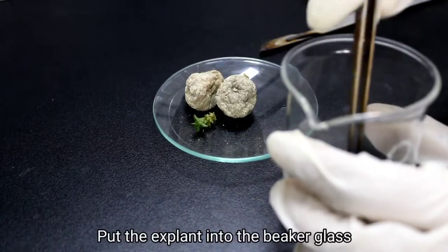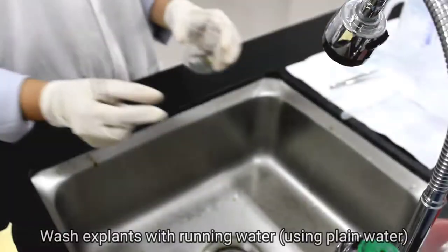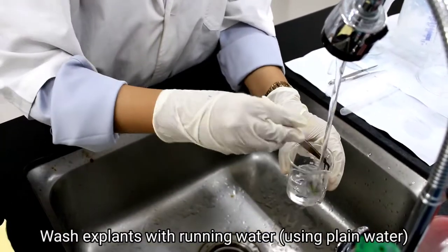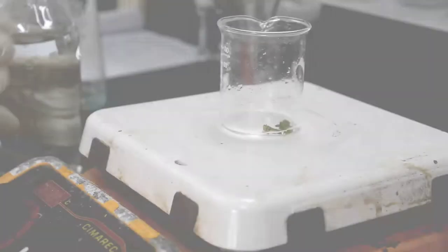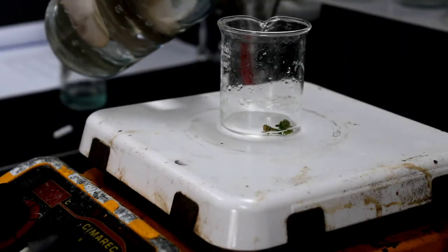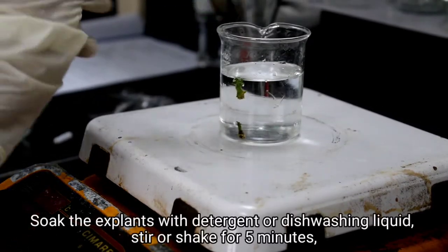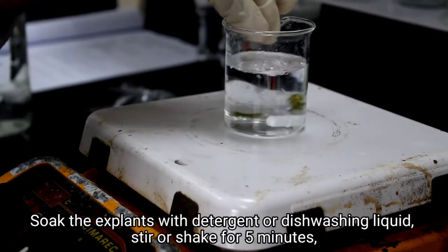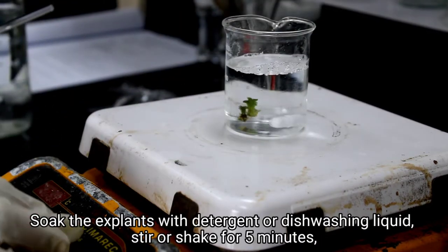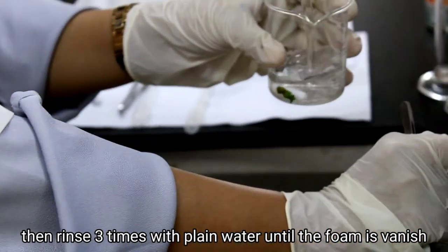Put the explant into the beaker glass. Wash explants with running water. Soak the explants with detergent or dishwashing liquid, stir or shake for 5 minutes. Then rinse 3 times with plain water until the foam has vanished.